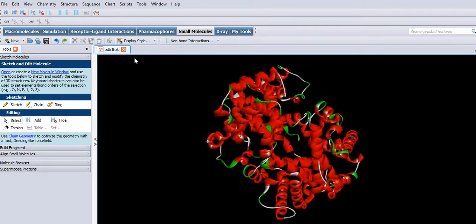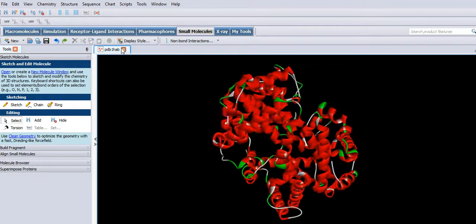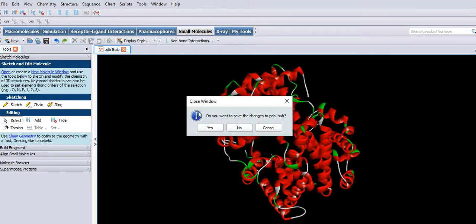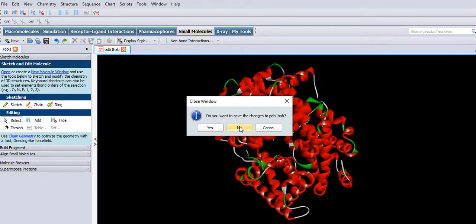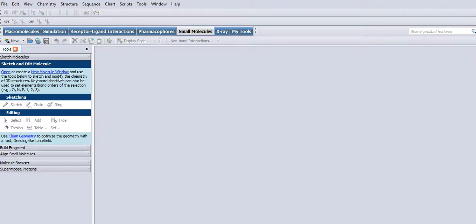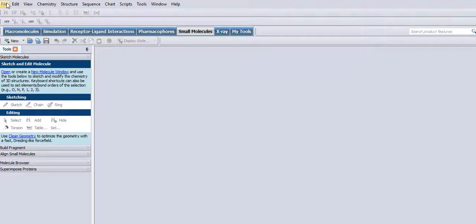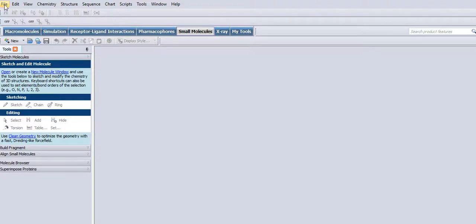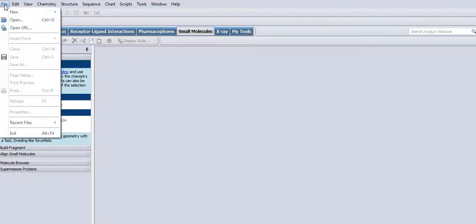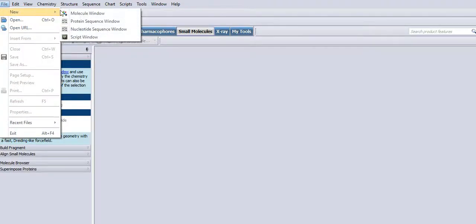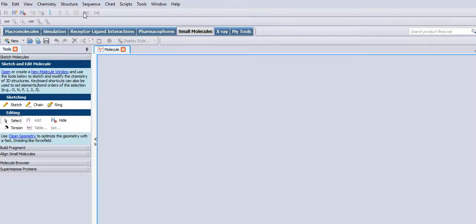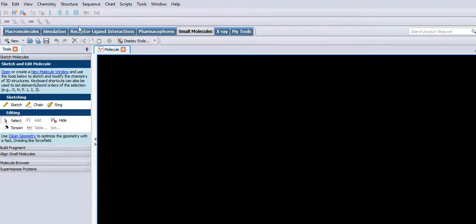So I think the best thing to do is just to construct a small molecule. I'll have a pop at aspirin I think. File, you mark your window, and looking at this section here, sketching, select ring.